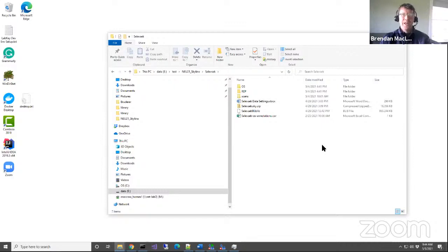Yeah, I'm not sure I would do. I mean, you can import. Yeah, I don't know. I can't actually comment on whether that's possible.